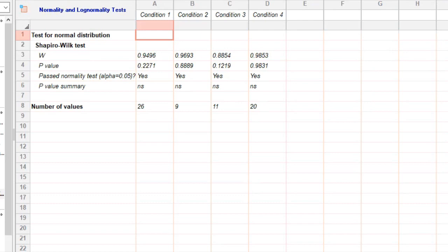Now, it's time to interpret the results. GraphPad Prism will provide the test statistic and the p-value associated with the normality test. If the p-value is greater than your chosen Significance Level, e.g. 0.05, then you can conclude that the data follows a normal distribution.